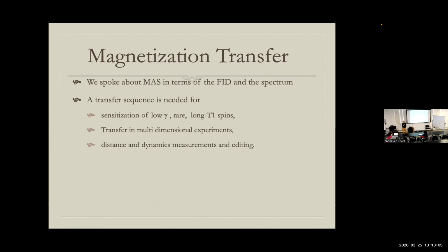I just showed you that in the context of a pulse sequence. And also, we use these same pulse sequence elements to measure accurate distances, maybe torsion angles. A close cousin of these sequences that we're going to be talking about will be used for shearing and anisotropy measurements. So they get used for fine structure to get constraints for structure calculation, that sort of thing. They get used in so many different ways.